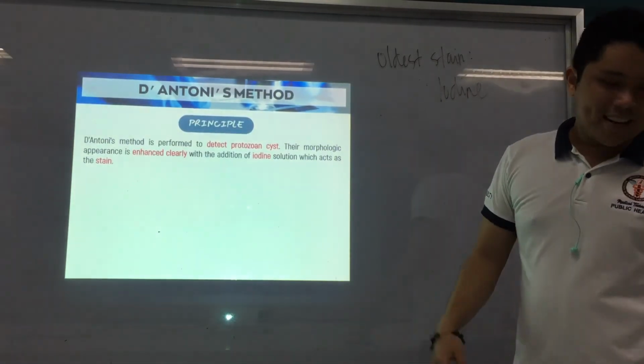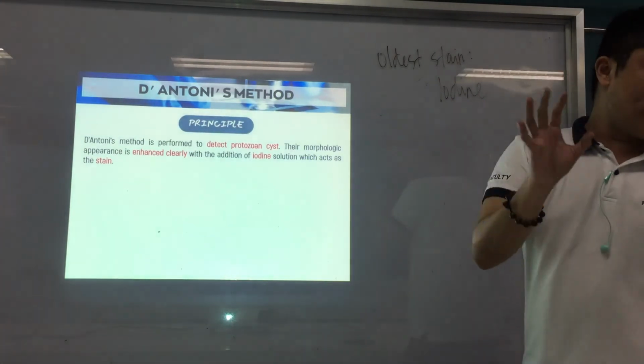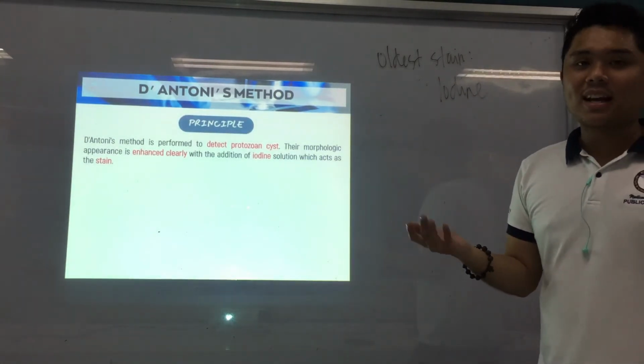Now, do we see trophozoites here? Yes or no? No. That is because the trophozoites die in iodine.